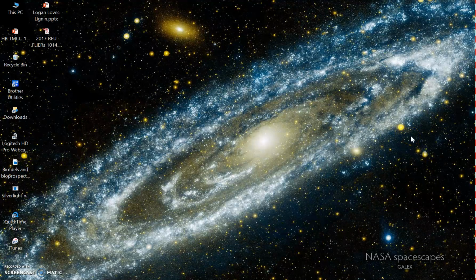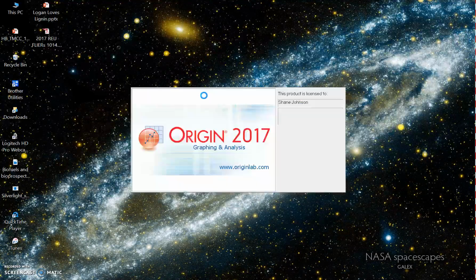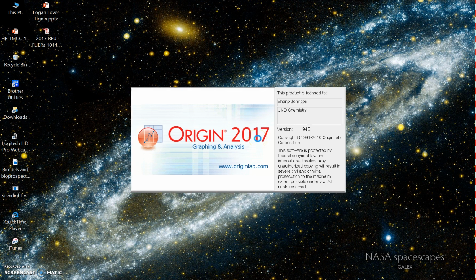So in this tutorial, I'm going to show you how to analyze data that is obtained with calc software through the OCEC instrument, and just show you a couple things on using Origin software. So we'll begin by opening Origin Pro. The version we're using right now is Origin 2017, as we can see here, and we are using the 64-bit version. So we'll just let this software load for now.